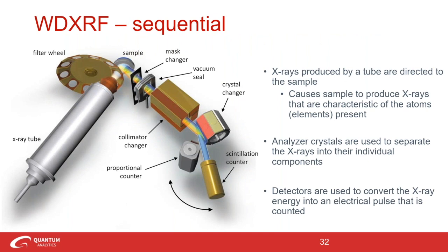With WDXRF, there are two types or two configurations of collecting spectra. You have sequential and simultaneous. Now, in this discussion, we're not going to dive into simultaneous. Today we'll talk about sequential. I think it'll be useful for this discussion.